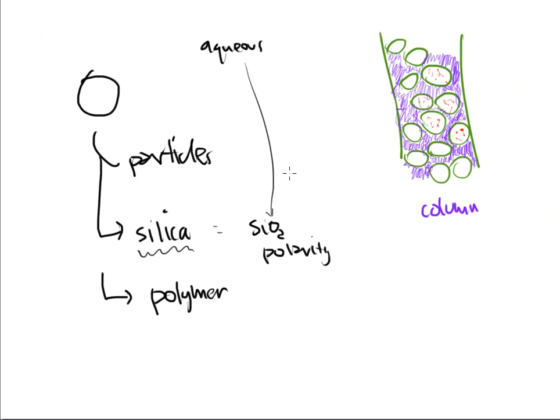The problem, though, is that the silica is not really as stable. And it can break down over time if I'm not careful. And there can be interactions with the silica that maybe I do not want. So I've got to be really careful when I look at the silica stationary phase. Because of that, the silica, well, it's not even really a choice anymore for us.